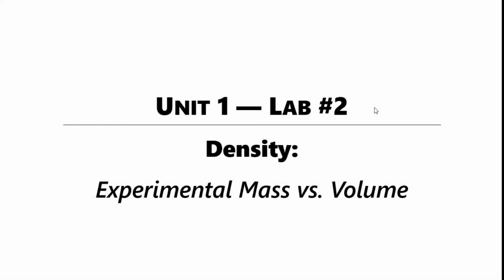Okay, so far in this class, we've been doing some measurements on properties of matter like mass and volume, but sometimes properties of matter are a combination of different measurements that we would usually make separately, like density. So we can figure out how massive something is, how much matter is packed into something by using something like a digital balance, a digital scale.